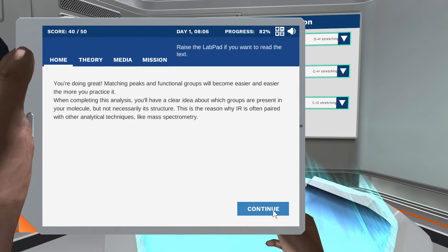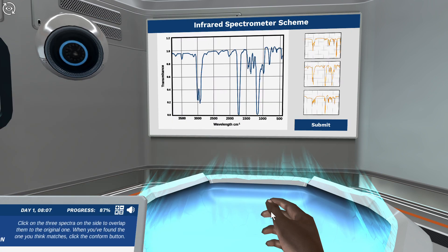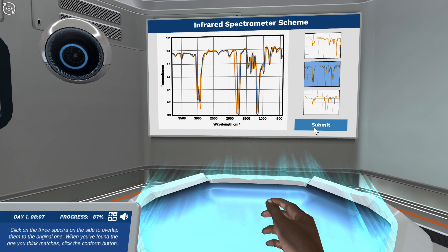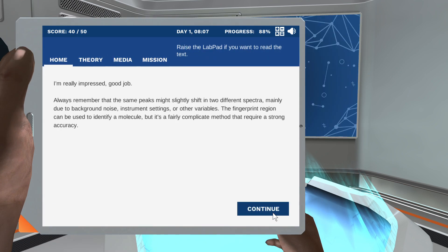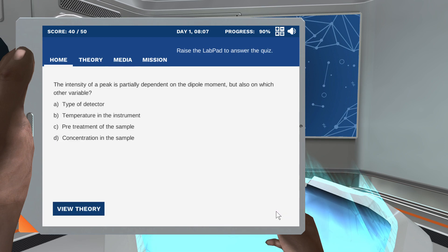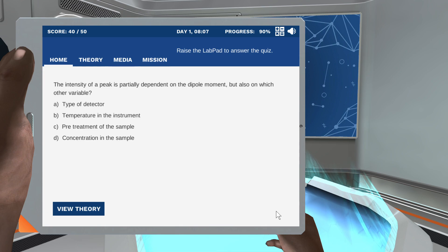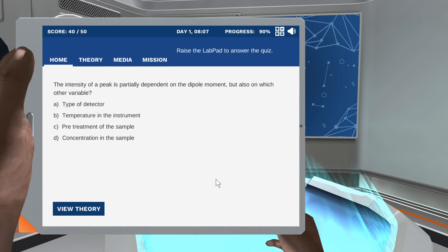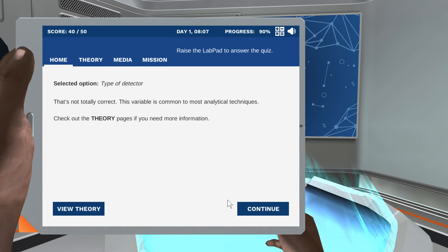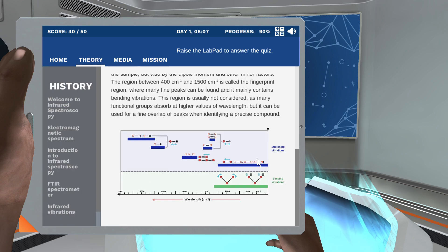When completing this analysis you'll have a clear idea for our last activity. The intensity of the peak is partially dependent on the dipole moment — but also on which other variable? This variable is common to most analytical techniques. Check out the theory pages if you need more information.